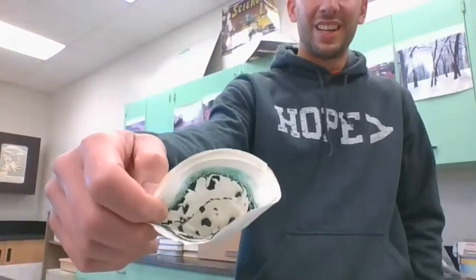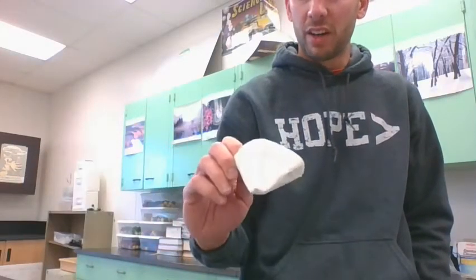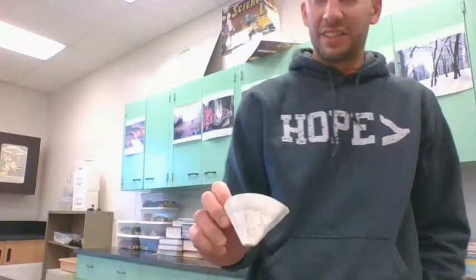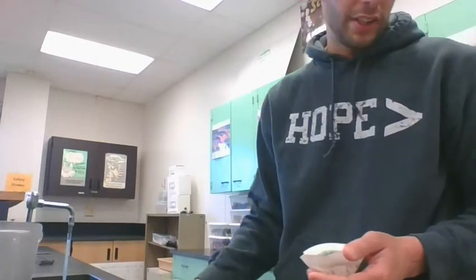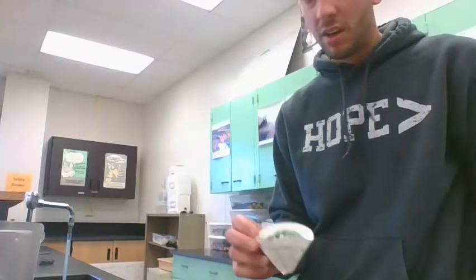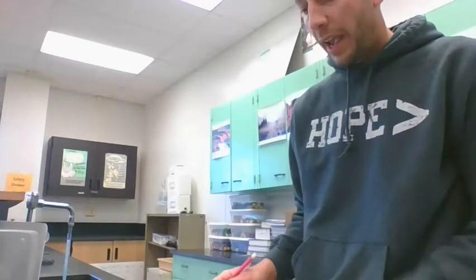The solid kind of all shriveled up a little bit once we got the water out of there. Really, it's not as neat looking as it was before when we had all the big spongy pieces. So I'm just gonna weigh it, and we got to do our percent yield. Before I weigh that, I went through and did the calculations here.